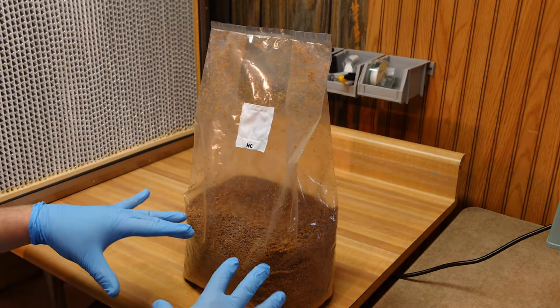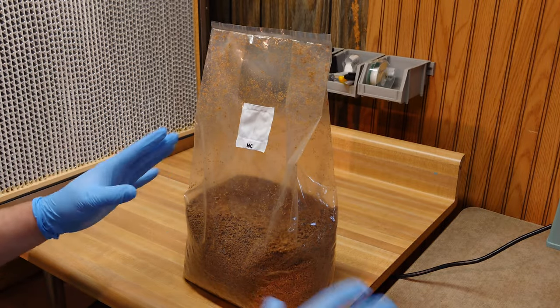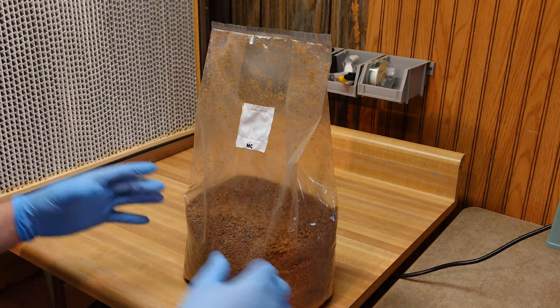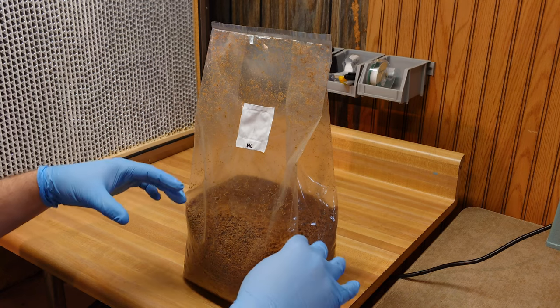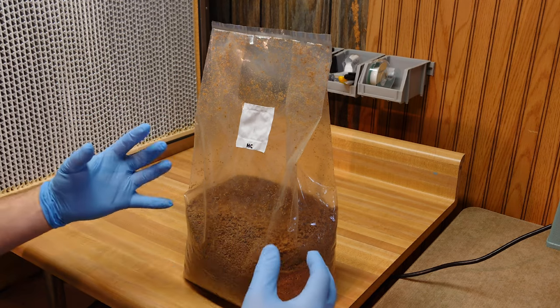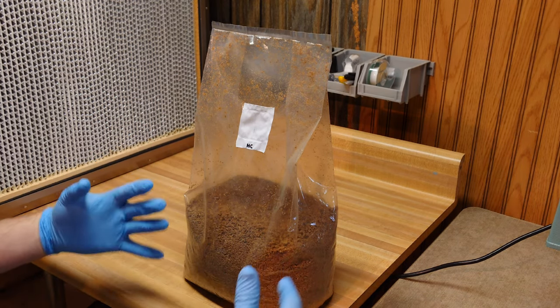Mixing bran in with your grain spawn is a great trick. It helps dry out your grain more quickly so you don't have to let it air dry. You can also sneak some bran into your block without increasing contamination risk. It gives you extra inoculation points - so instead of just grain kernels you have all those little bits of bran in there too, helping your block colonize faster and getting some extra nutrients in. All good all around.